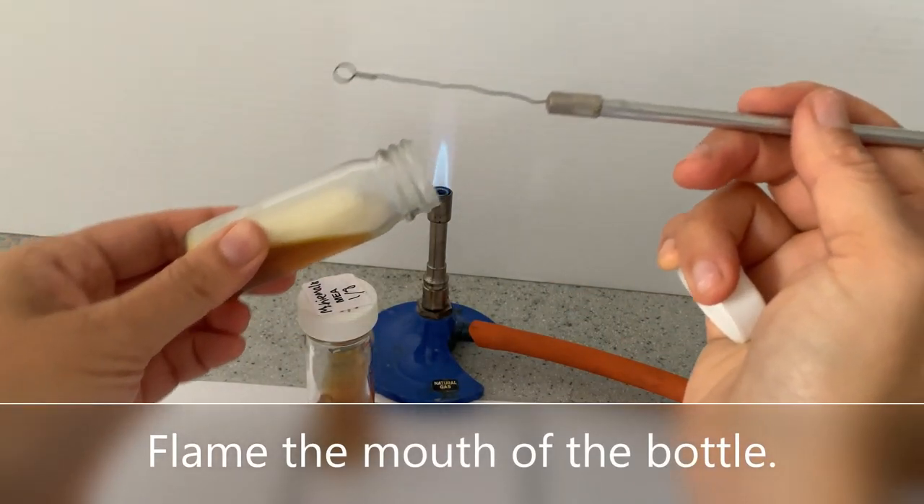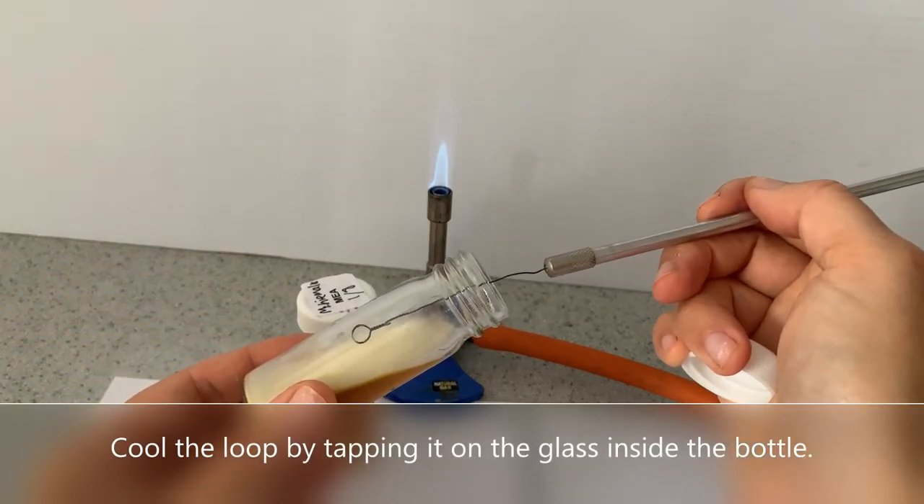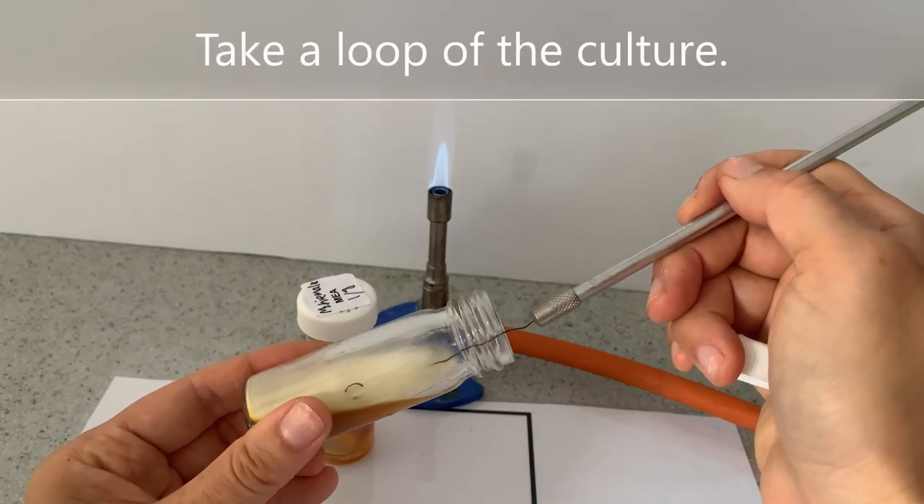Flame the mouth of the bottle. Cool the loop by tapping it on the glass inside the bottle. Take a loop of the culture.